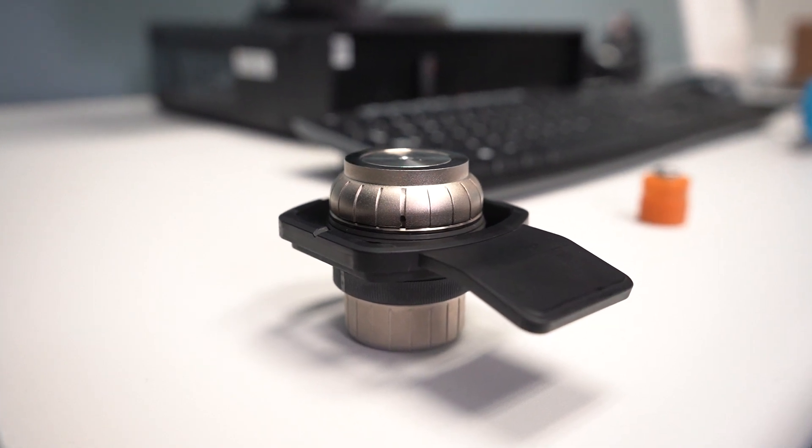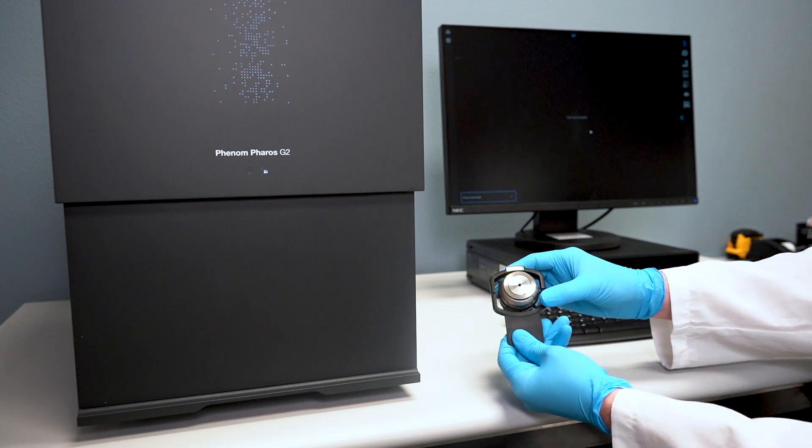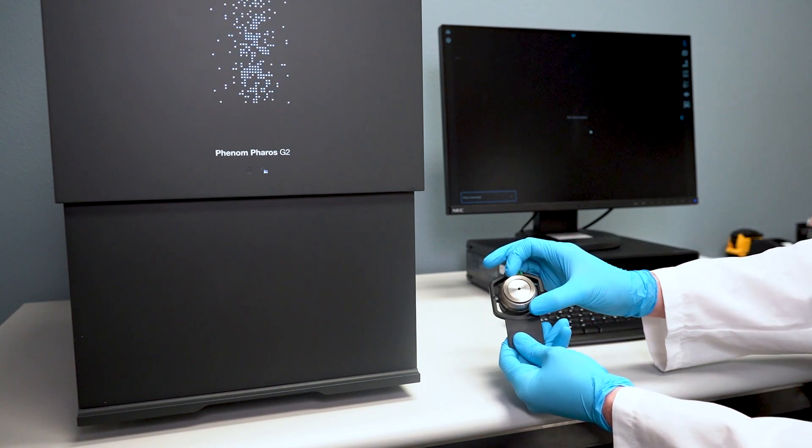Here's the sample holder which holds one sample stub of up to 25 millimeters in diameter. The working distance is adjusted by turning the outer ring.